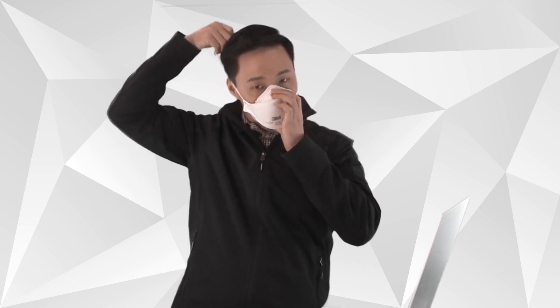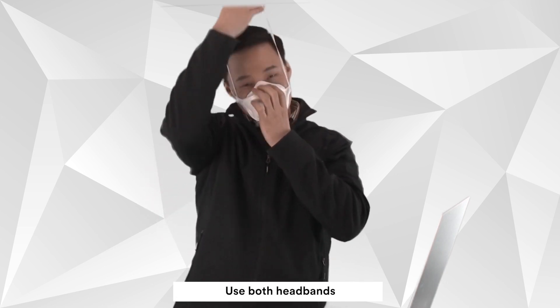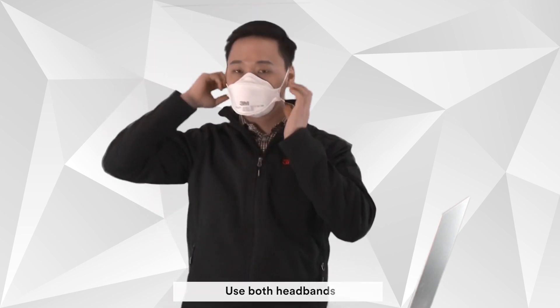Open the respirator into a cup shape and place it on your face with the nose clip towards the top. Be sure to use both headbands, with one towards the top of your head and one around the back of your neck.